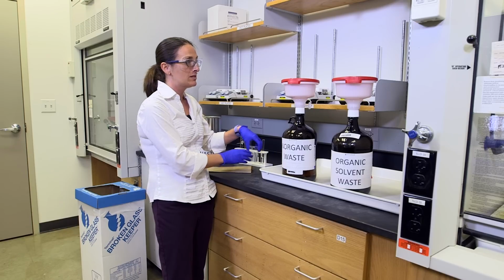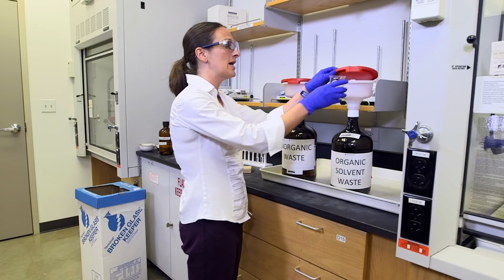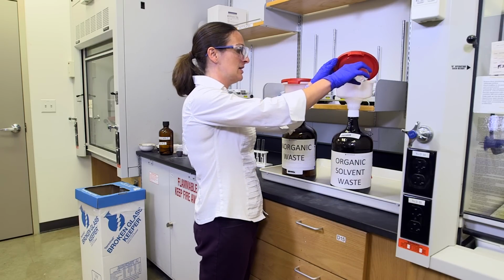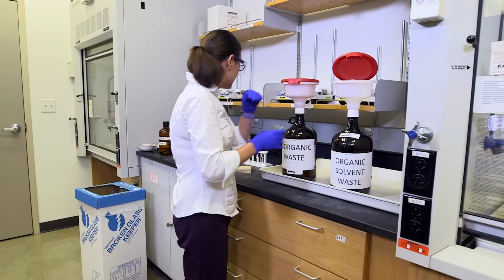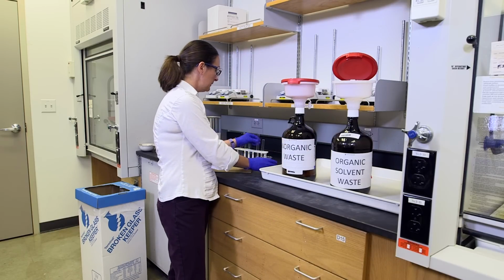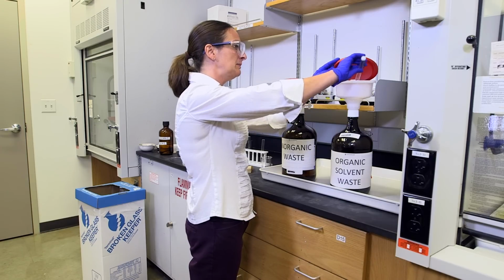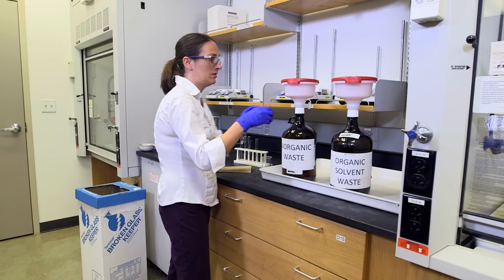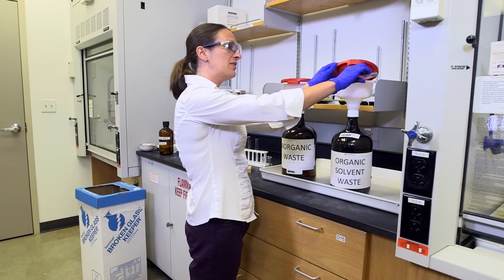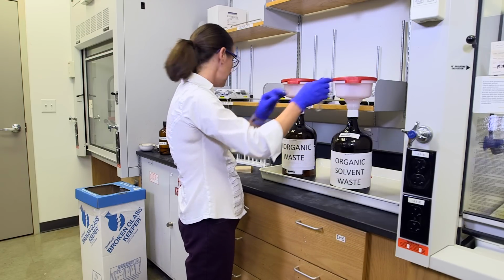My organic waste is a lot of what we worked with, so acetone and cyclohexanes and all of my solvents that are not water-based are going to go in organic solvents. Even if there's a little bit of water in it, you're going to put the whole thing in organic solvent waste.